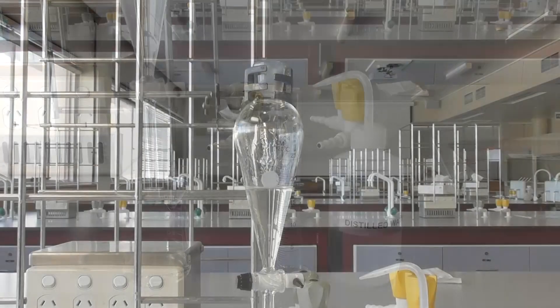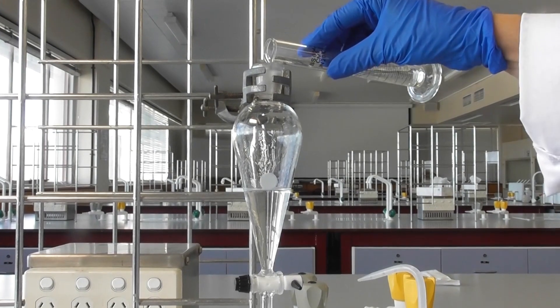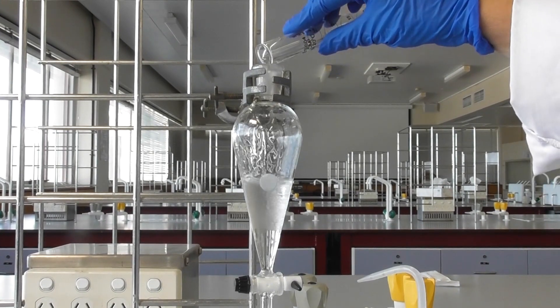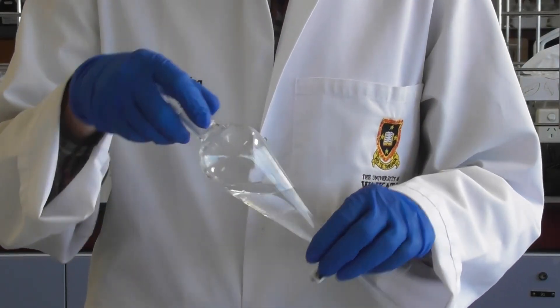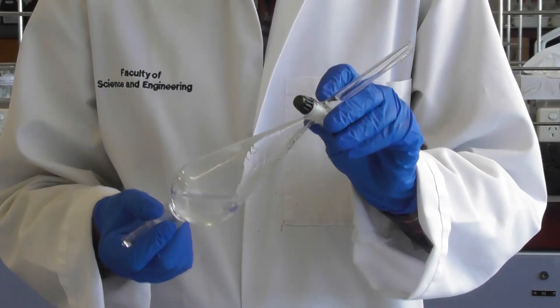A second washing step uses distilled water to remove any salts from the organic layer. Measure and add distilled water, stopper the funnel and shake again.